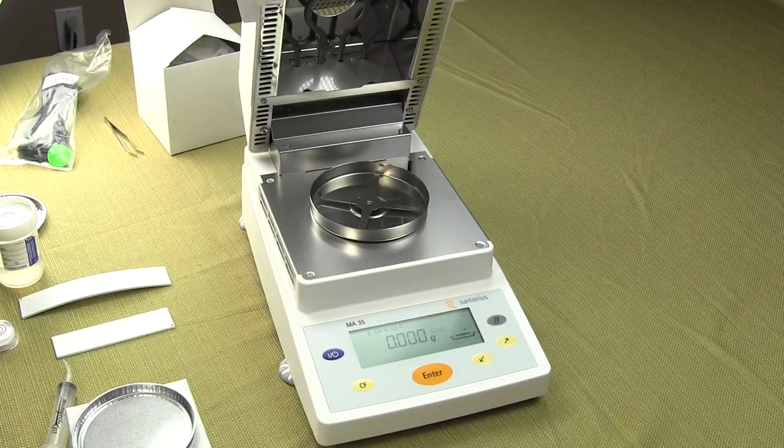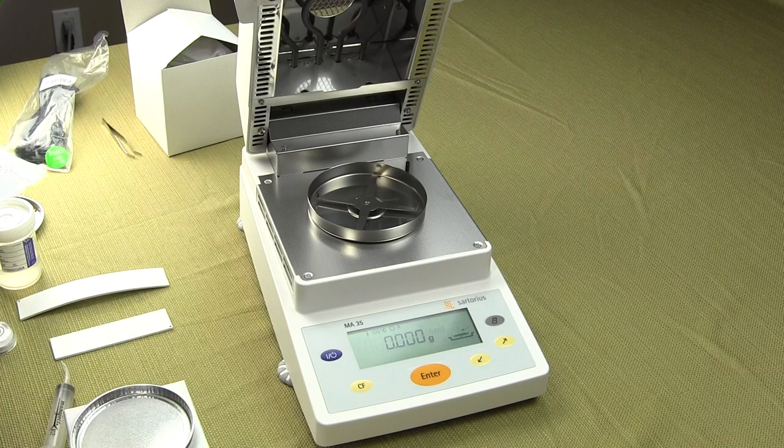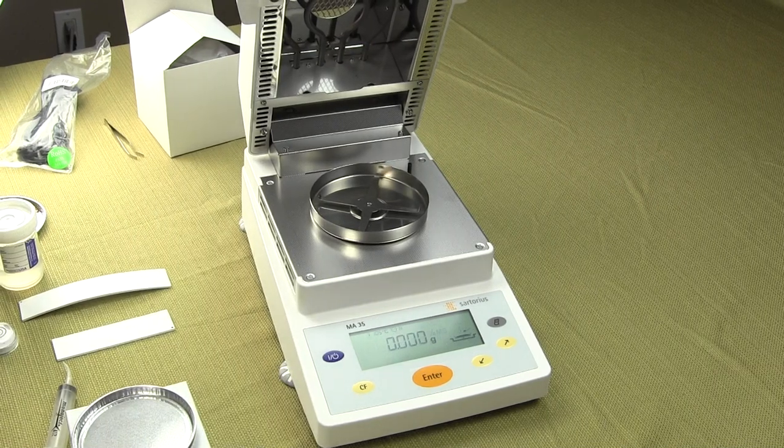Welcome to Precision Weighing Balances. Today we'd like to show you the Sartorius MA35 Moisture Balance.